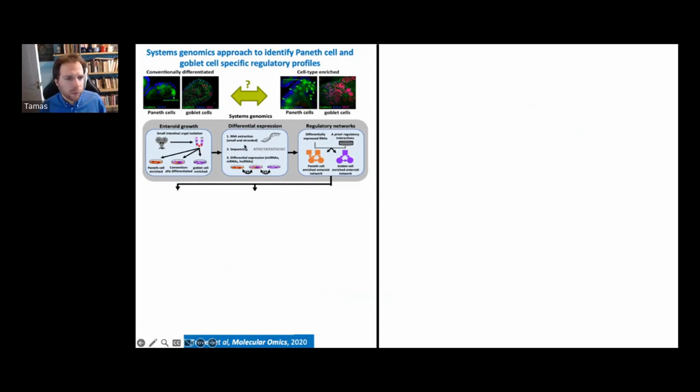After this, we isolated the RNA from these organoids and did the sequencing. I said this sentence, I think, in less than 5 seconds. This was a 2-year part. So this box was a 2-year thing. There was not a lot of RNA normally extracted from these very small cultures. So we worked a lot on improving that. Nowadays, it's actually getting easier. But it was a really challenging and interesting project to make sure that we have enough RNA for sequencing. And at the end, I have to say that we overdid ourselves. We had 4 times more RNA than was needed. So we could do a very nice deep sequencing, focusing on microRNAs as well, which made the project even more exciting.